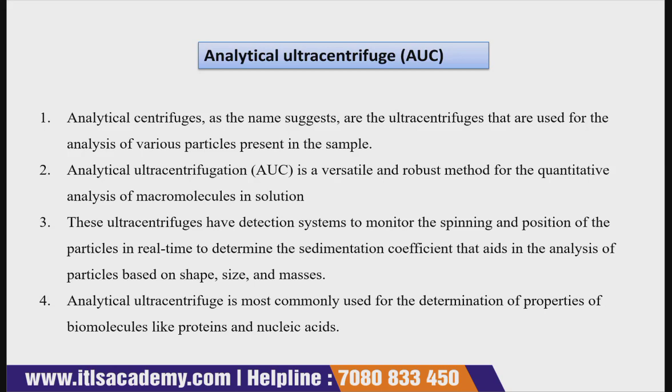So as we have discussed in our previous slides, this method of ultracentrifuge analyzes or separates any particle on the basis of their shape, their size and their masses.